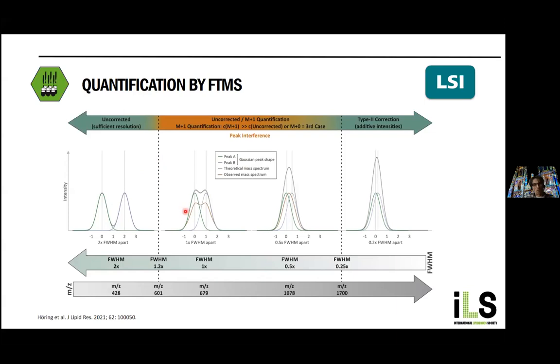So a key message: you should figure out these type 2 overlaps in your instrument platform to evaluate the best way of correction or quantification. And that is really a key hurdle to get to accurate quantification in lipidomics data.